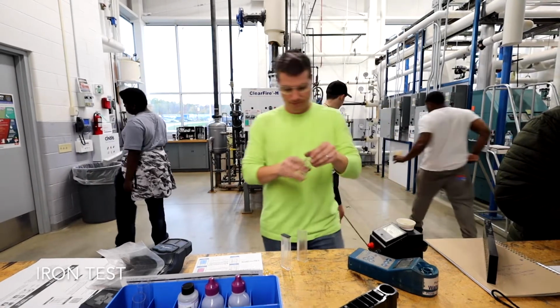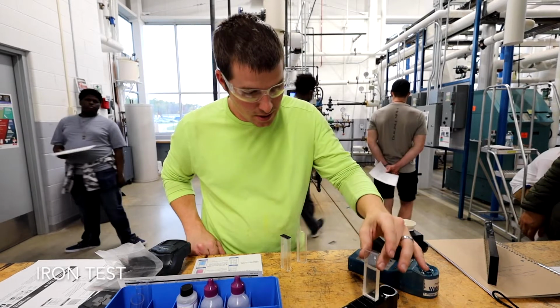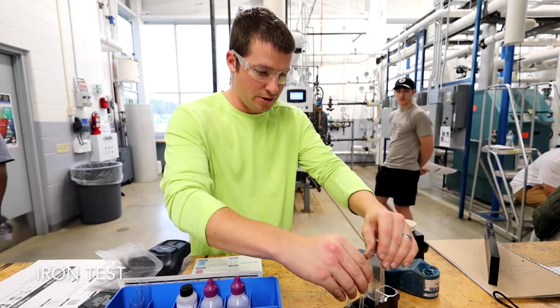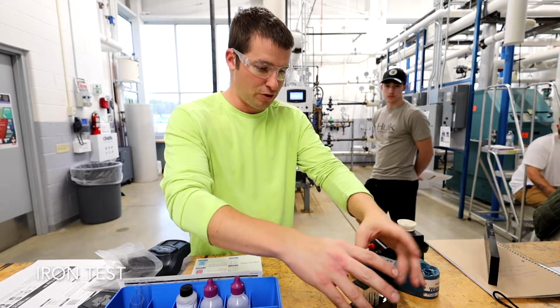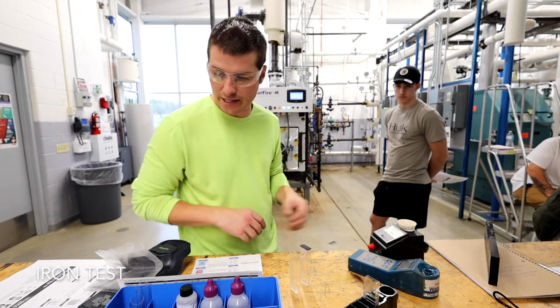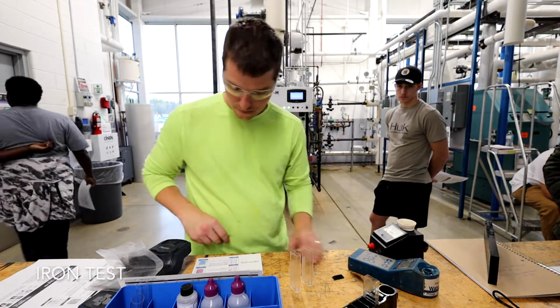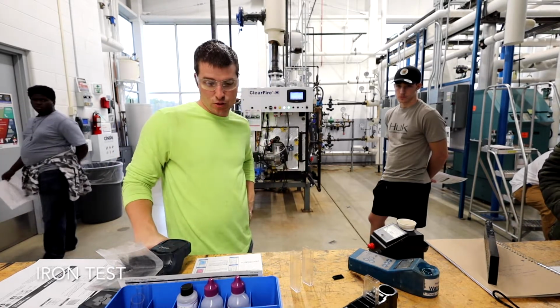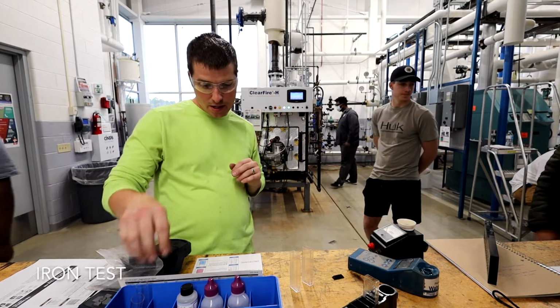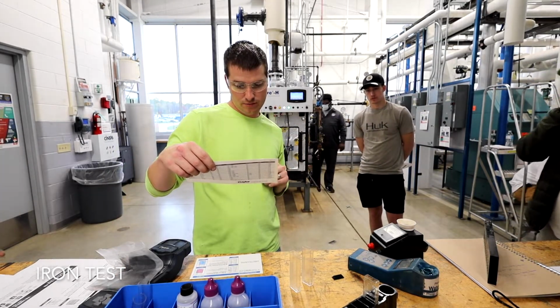Thank you very much. One of them we got filled up to the 11.5 milliliters, so we'll put that one on the left side. On this one you can tell there are 3 slots that perfectly hold these, so that's where we're going to put them. When he gets more sample, we'll fill up the other 2, and then we'll move to the next step. After we do that, they're all in there. Then align the appropriate slide on the comparator base for a color match.